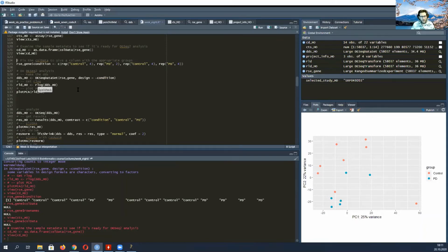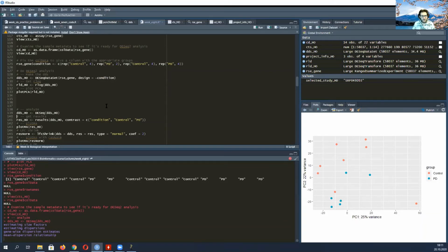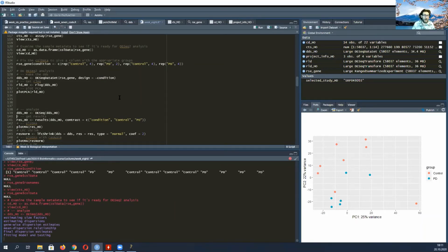So just out of curiosity, did you actually run the analysis? Oh, yeah. Okay. I was just curious because the PCA, I'll tell you, doesn't look good, but I was curious if you would end up with any significant genes, or if it would just be a really small number. Because I've seen that before with patient data, especially, which it sounds like you have. Yeah. Also, look, the PD is split into sporadic and not. If I had to bet money, I'd say these two up here are the sporadic ones. But who knows? And then these 4 might be the genetic ones, but let's see.